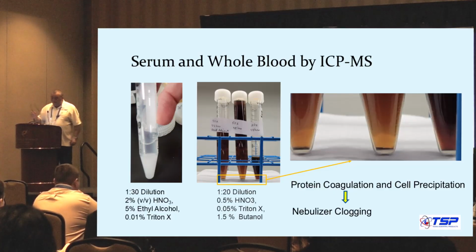But if you have something like this, which is whole blood, dilute and shoot, you have this protein coagulation. If you run it through a concentric nebulizer, it's going to be the same story. You have to stop, clean it, unblock it, and all of that.